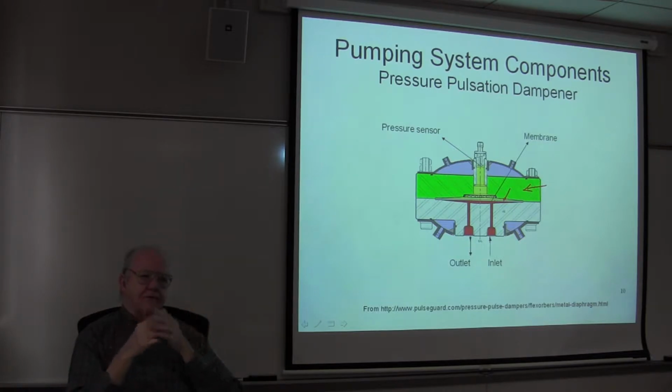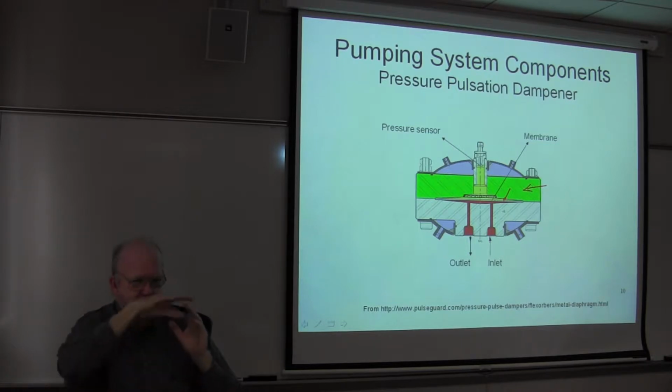It's really rather like a capacitor in an electrical circuit, where the capacitor will store charge. This is storing fluid, and when the pressure attempts to drop, the fluid expands against that drop and maintains a constant current, a constant flow. And that's what happens in a capacitor.